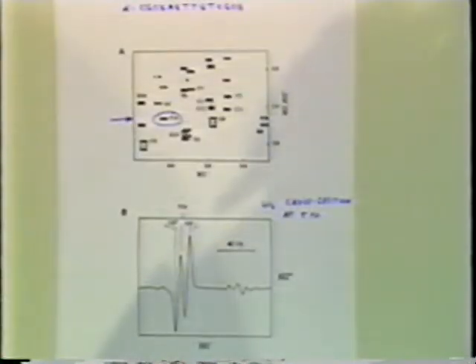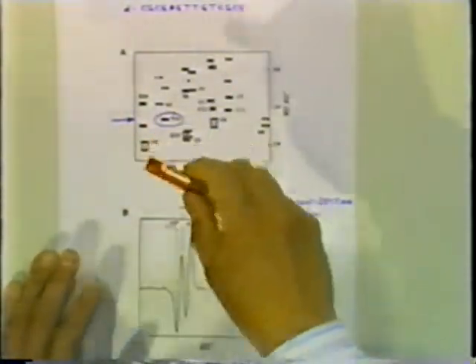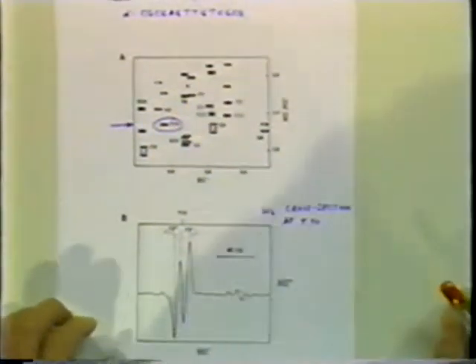Anil, on 526, when you just talked about this cross section, I'm just concerned about the scale. This entire set of wiggles goes within that thing called T10 up there. You've just expanded the thing in the top circle. Yes, expanded out, that's the cross section. See, this is a contour plot. Think of the contour plot as something which is up and down like this. So how many peaks are we seeing in this bottom one?